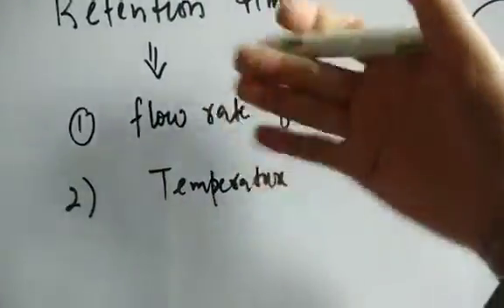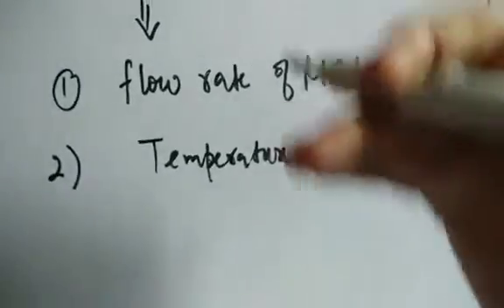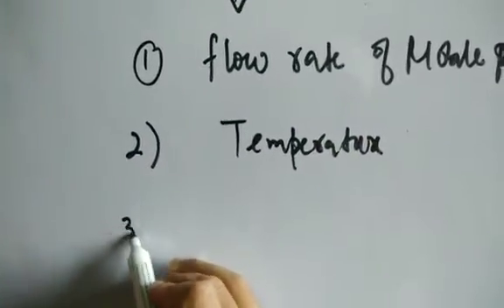Outside the column, what is the temperature; inside the column, what is the temperature; the flow will be accordingly, the separation will be accordingly, the retention time will be accordingly. So it depends on the temperature.